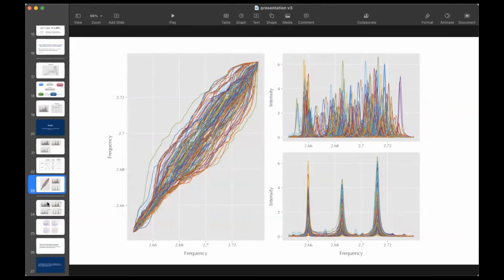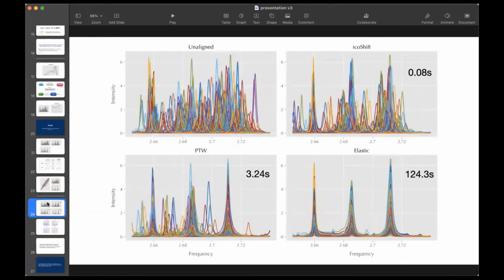I suppose my question is: is the improvement in fit commensurate with the extra degrees of freedom that you're allowing in your model? Or is the improvement better than what you would expect simply from a degrees of freedom type of argument? So in other words, is it significant? I suspect it is, by the way, but your talk hasn't really addressed that.